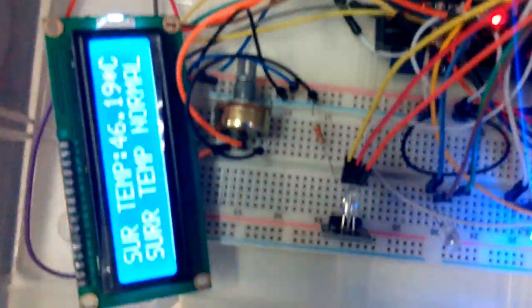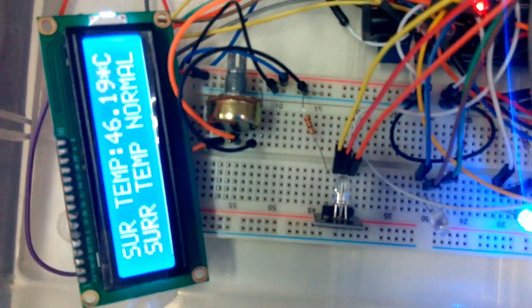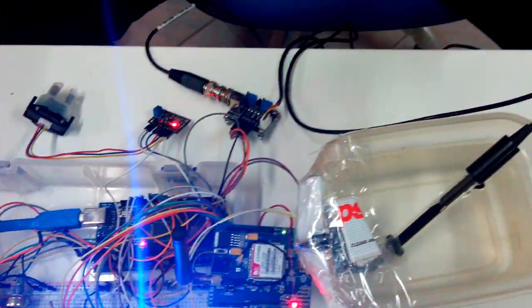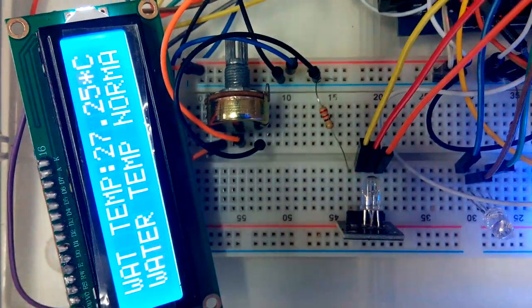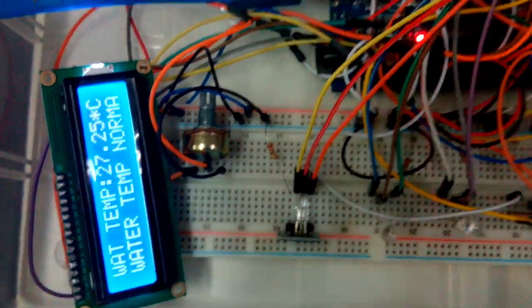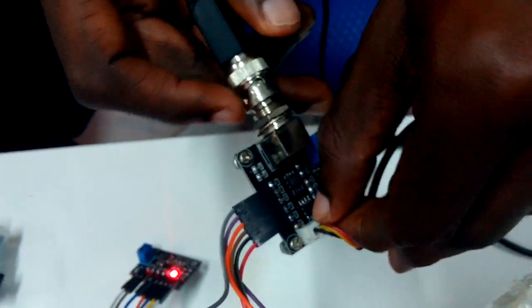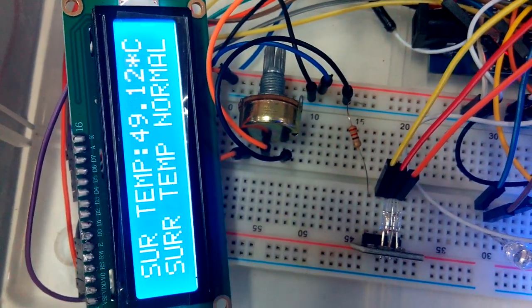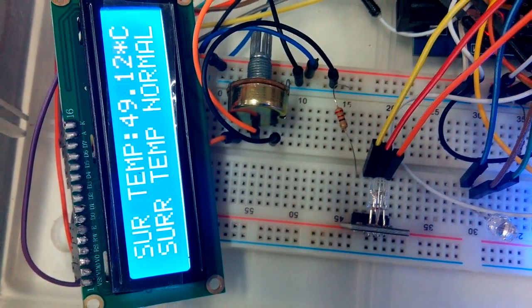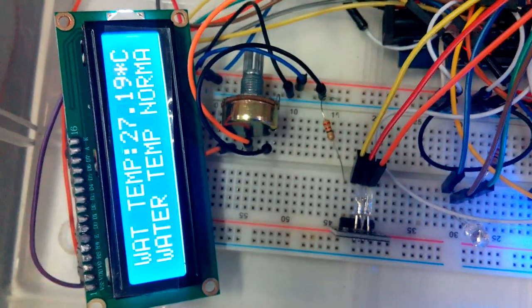Now we are taking readings from the temperature sensor. The surrounding temperature is 46.19 degrees Celsius, which is normal. The temperature inside the water is 27.25 degrees Celsius, which is also normal. If I touch the temperature sensor to give it a little higher temperature, let's see the readings. It is 49.12 degrees Celsius, which is normally okay, because I have set the limit to 50 degrees Celsius — from 50 degrees it will tell you the temperature is high. The water temperature is still 27.19 degrees Celsius, which is normally okay.